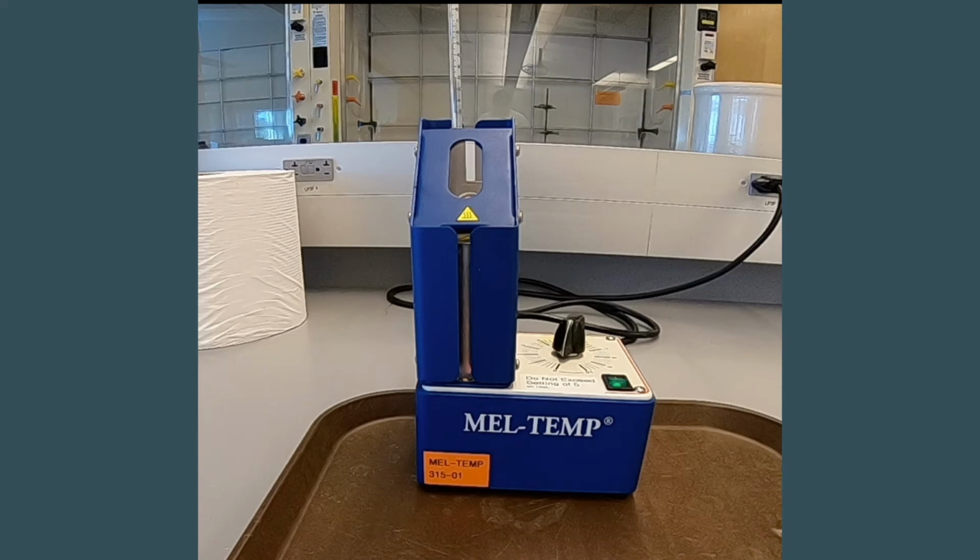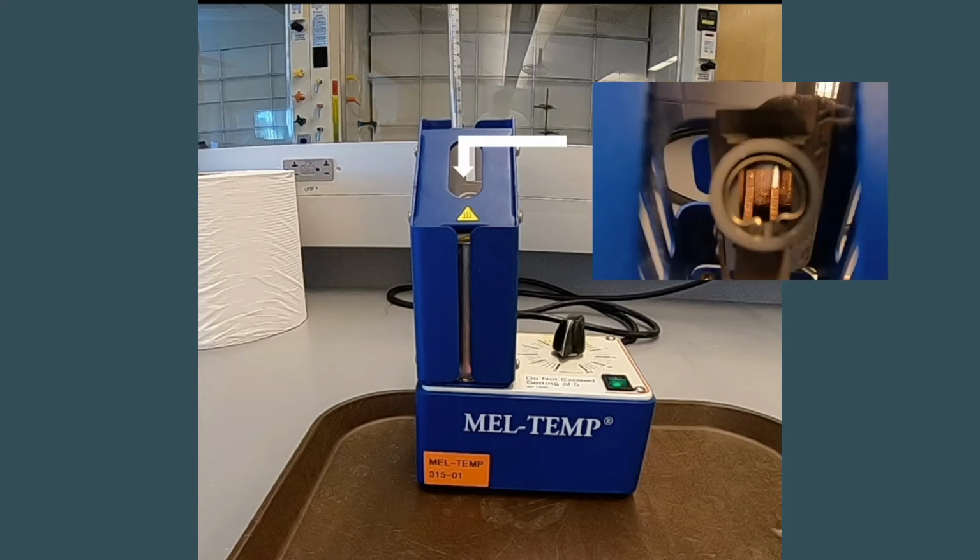Before we actually put our tube into the Mel Temp, we want to be comfortable with the equipment. This is what a Mel Temp looks like. It has an on-off switch, a fuse for electrical protection, and a voltage control used to set the rate of heating, not the temperature itself. Here is the light source, which illuminates the sample, an eyepiece that magnifies the sample, the thermometer used for temperature readings, and the 3 slots allotted for placing your capillary tubes.